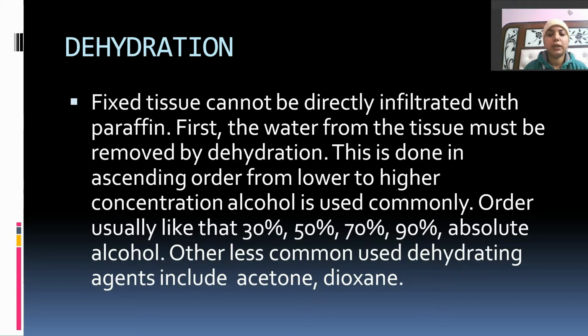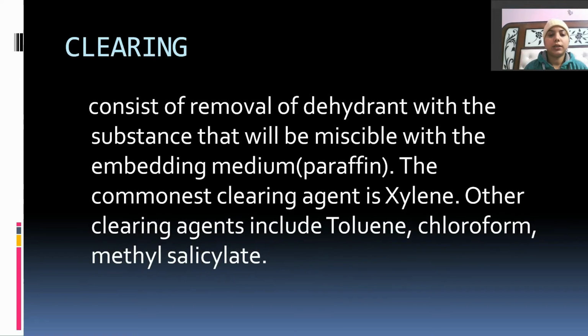Alcohol is commonly used. The order is usually like this: 30%, then 50%, then 70%, then 90%, and finally the absolute alcohol. Other less commonly used dehydrating agents include acetone and dioxane.